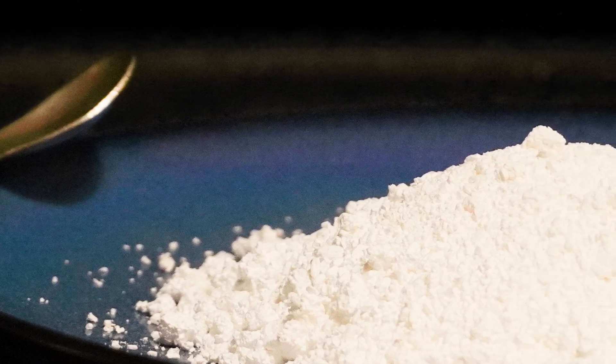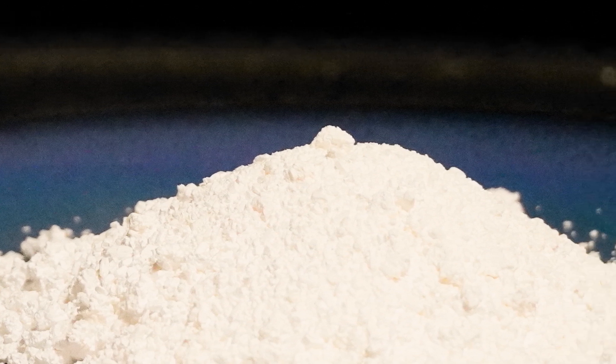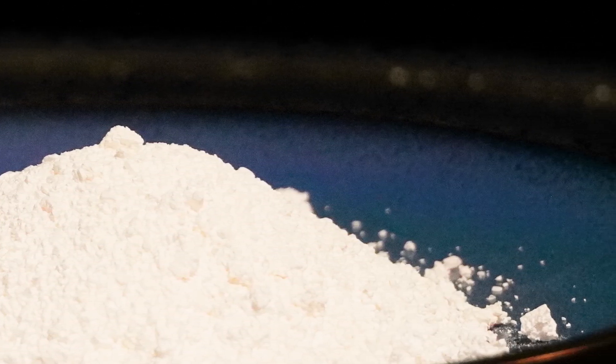Today we're going to be making magnesium sulfate. It's a drying agent mainly used to pull water out of different solvents, and it works so well it'll make anything drier than your mom's home cooking, of course.